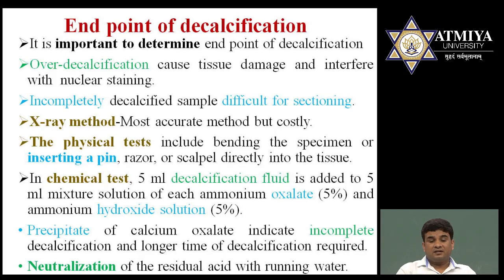Another is the physical test. Based on the texture of the tissue, inserting a scalpel or pin, you can identify the decalcification point, but this is not a very reliable technique. It has to be done by an expert histopathologist, so it is also not commonly used.